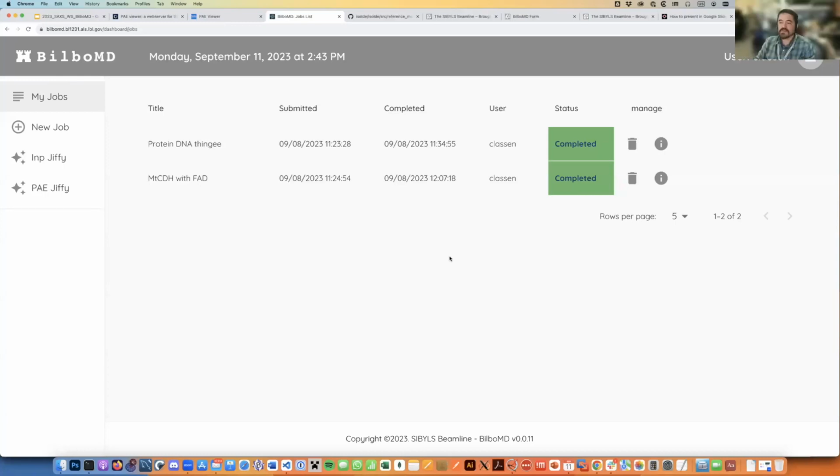Oh, okay. Well, I don't think that would be super difficult. The other thing which would challenge the computational resources is that AlphaFold 2 outputs 5 models. As a first approximation, I would probably take the top model, run that through the PAE domain finding code, and then take that along with your SAXS data and throw it into BilboMD.